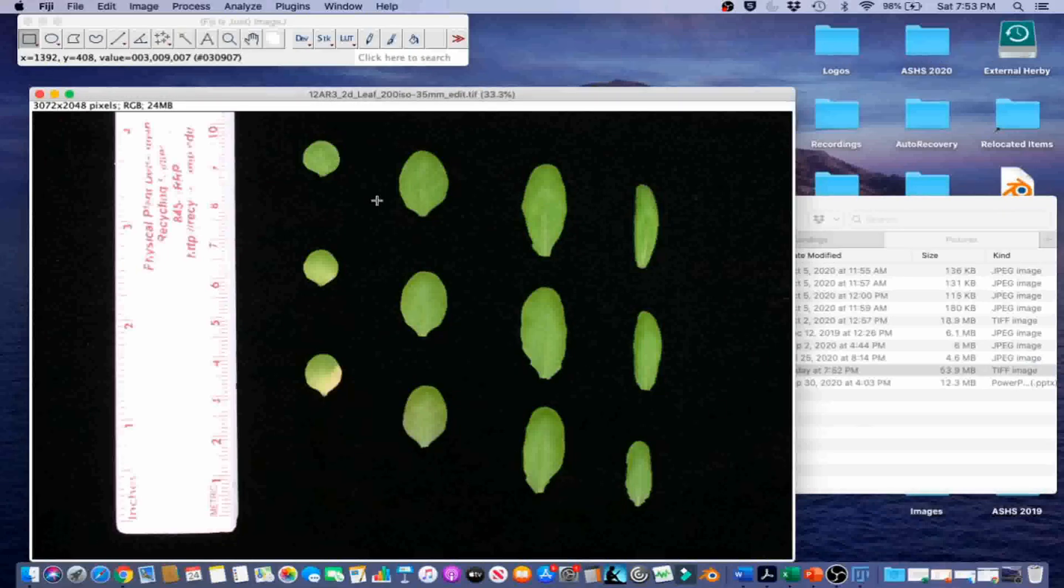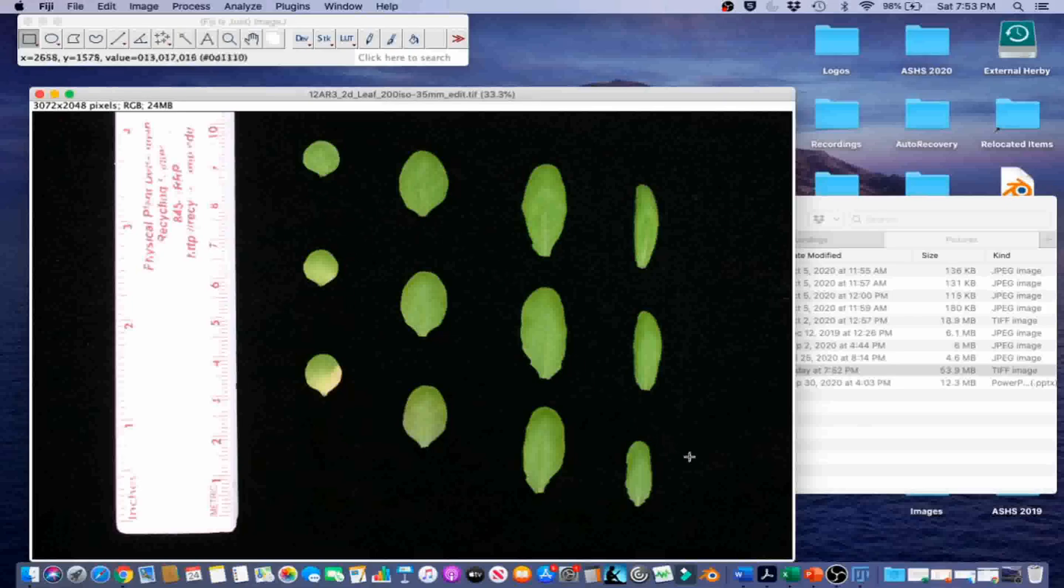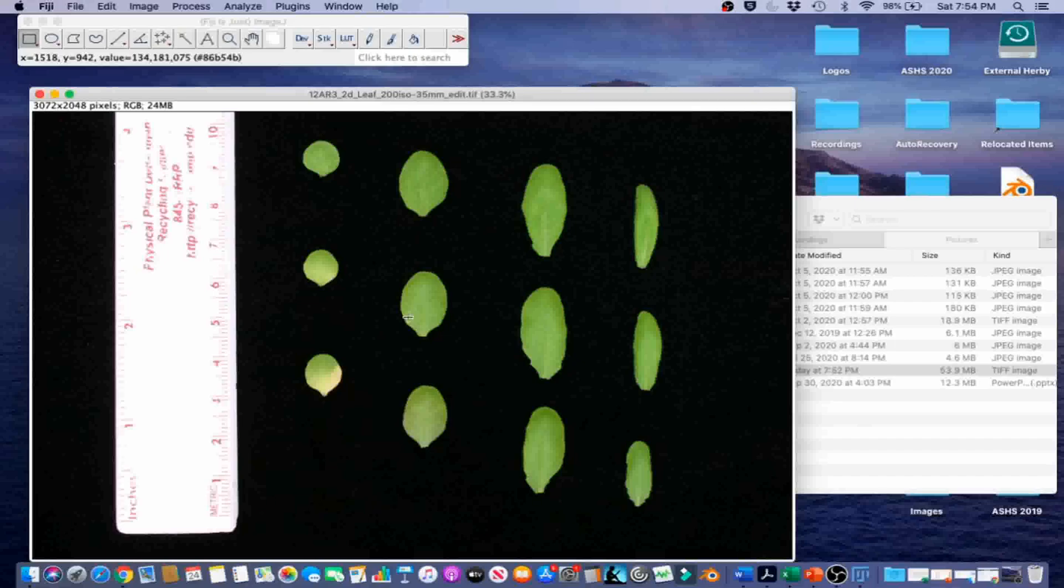ImageJ labels objects in the order of the upper left to the lower right corner. In light of that, the leaves in the image are arranged so ImageJ will count them row by row in order. This eliminates the need to resort the data later.